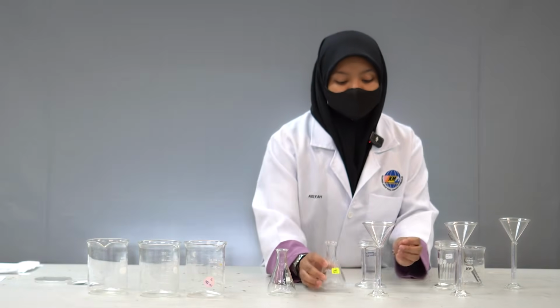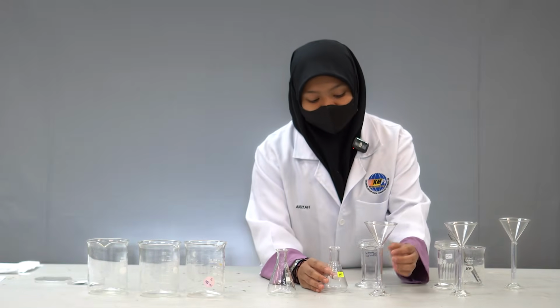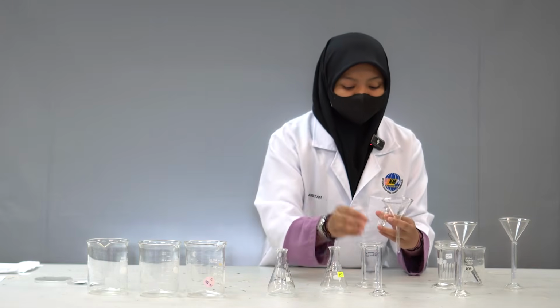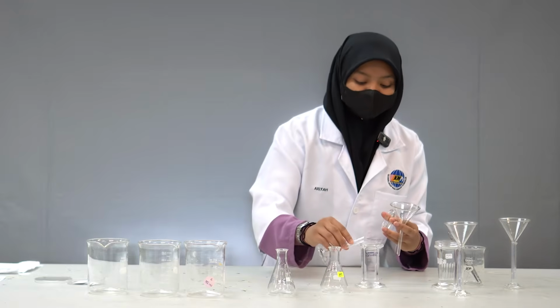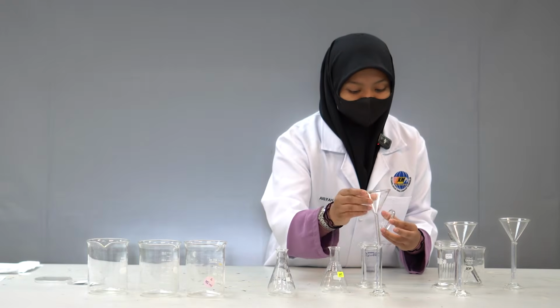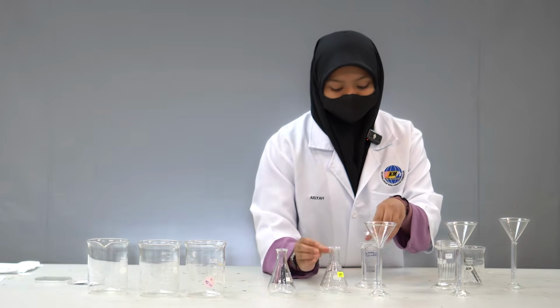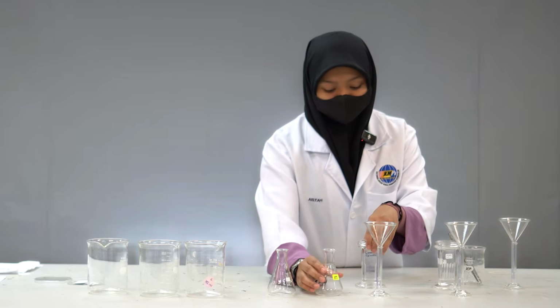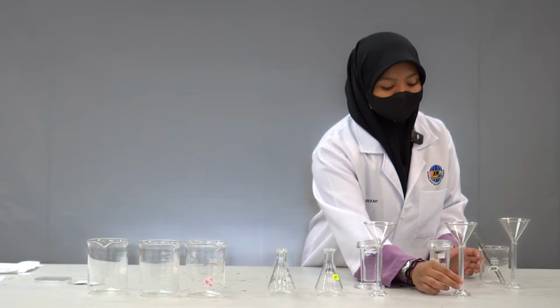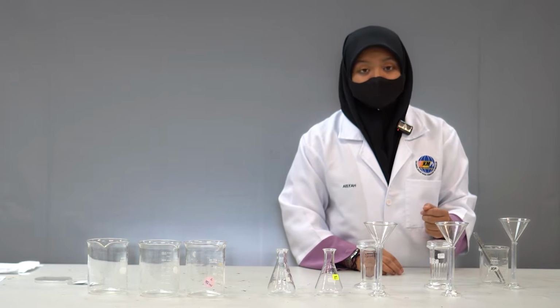I pour until you see the 5 ml, and from there you pour into the hexane and ethanol chamber. Same goes for the second measuring cylinder.